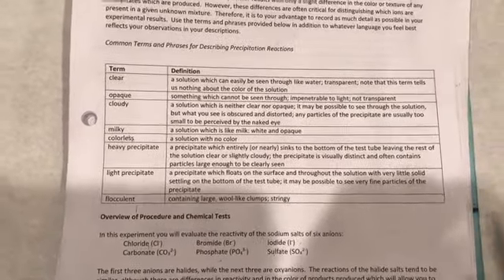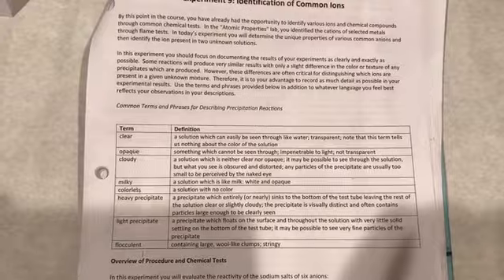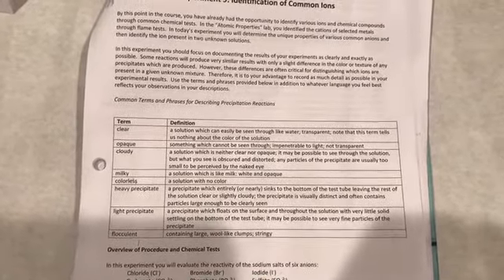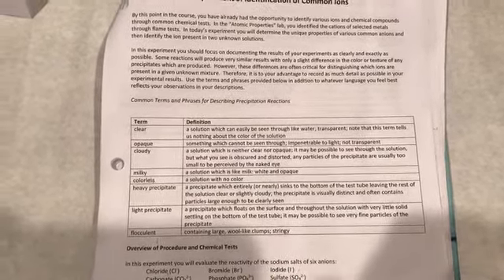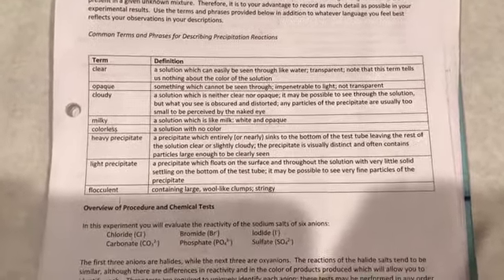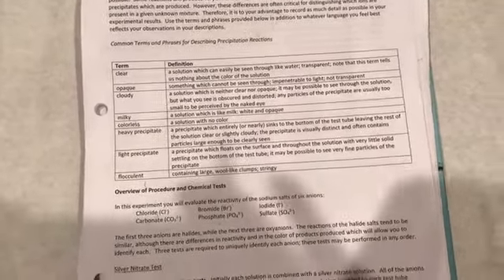It is, I would say, a similar experiment as you did in the atomic properties lab, where you identified different cations based on the flame test, and you saw that different cations, as per their emission spectrum, impart different colors to the flame. In this case, you are not using any flame, but you would definitely record the observations based on the precipitate or the clear solution.